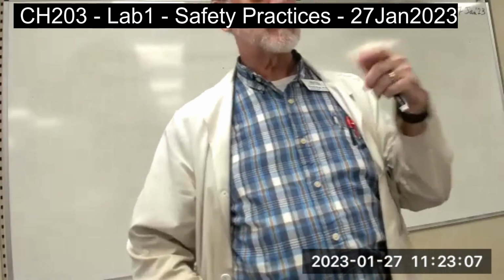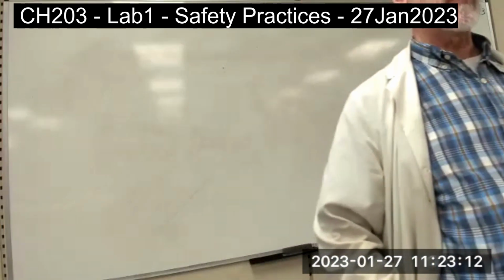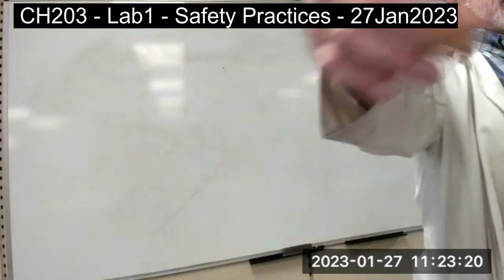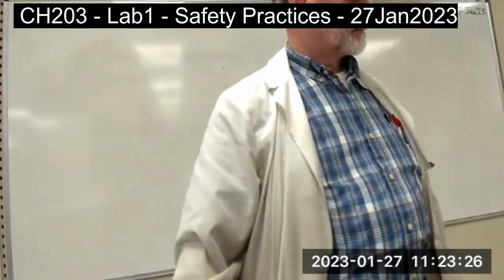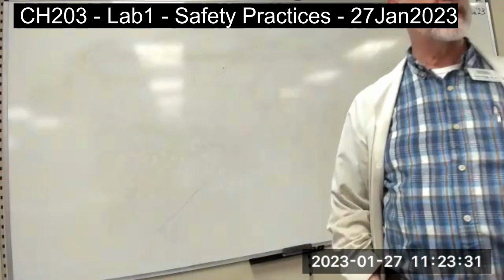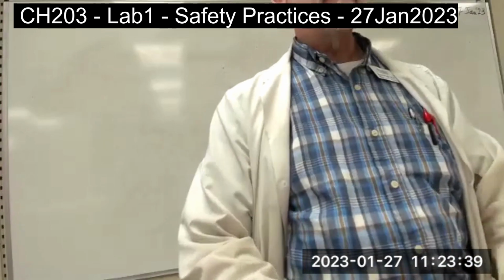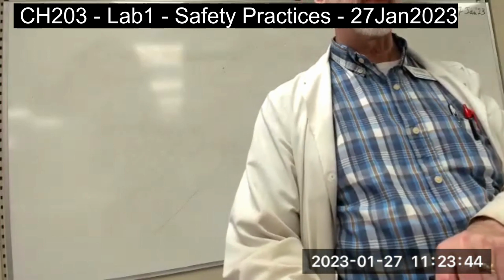If you have a drink, you can bring it in the lab during the lecture, if we're not doing an experiment, since we are using it as dual purpose. But when we start an experiment, bring your drink up here and put it close to mine, because in this area we don't have any chemistry going on. I mean, there's a lot of junk here, but I don't know who left that there. It's been here for 6 years. So, if you need to bring a drink into the lab, keep it up here while we're conducting experiments.